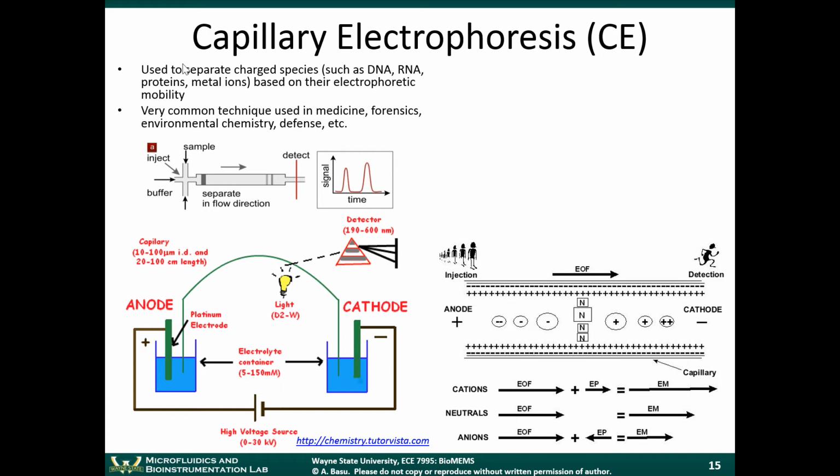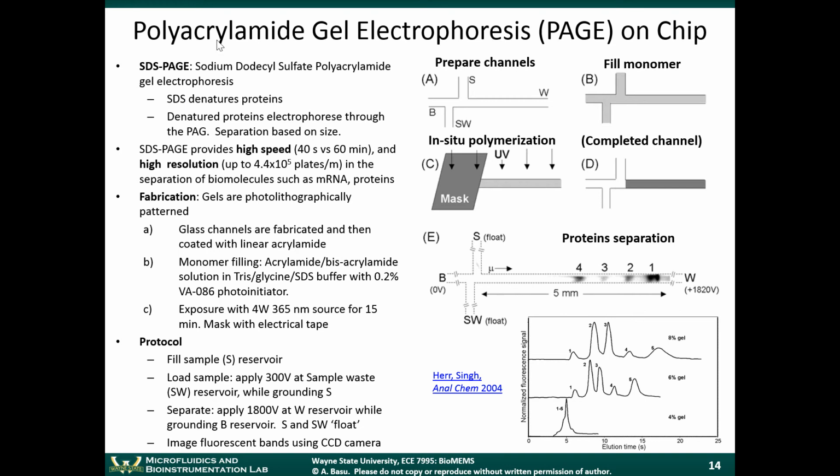So in this previous example, where gel electrophoresis was miniaturized in a chip, notice you have a very tiny capillary, but that capillary is filled with the gel. So the gel is what is responsible for helping separate the molecules. The gel is acting as a sieving matrix.